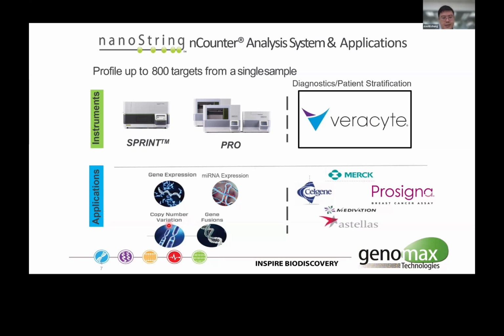For their research use panels, currently there are 2 different models, 2 different instruments that can actually work with their research use panels.